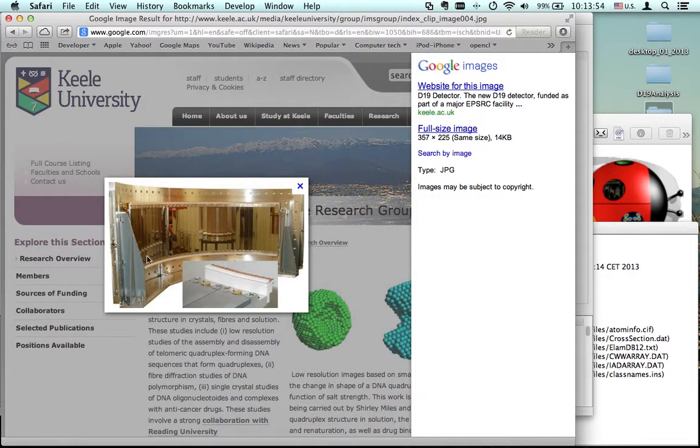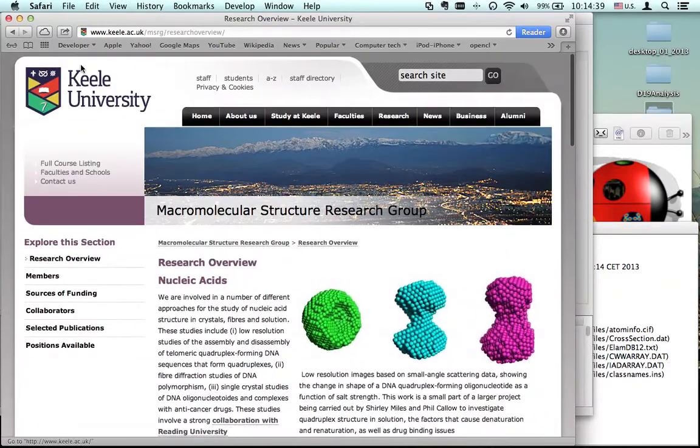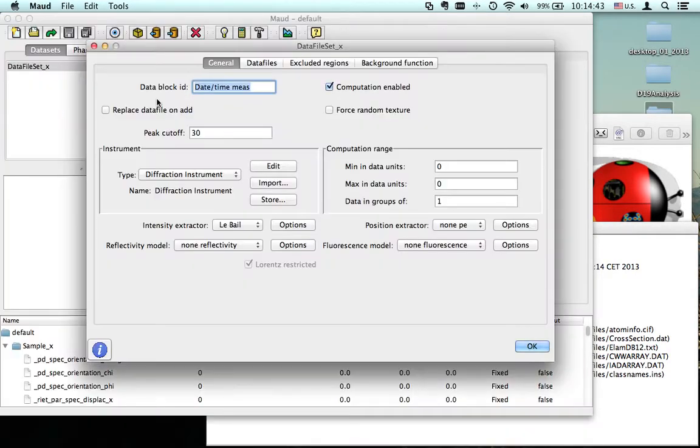So this detector collects an image with the data, so with the diffraction circle over here on a large 2 theta range. So we will take this image, and on this image, we integrate along the circle. But we don't take the entire circle in one pattern, we will separate it into different patterns, different parts of the circle, because this goes at different angles, and this will permit us to actually obtain the texture. Okay, well. Here there is not an image, but we just load one and see how it is.